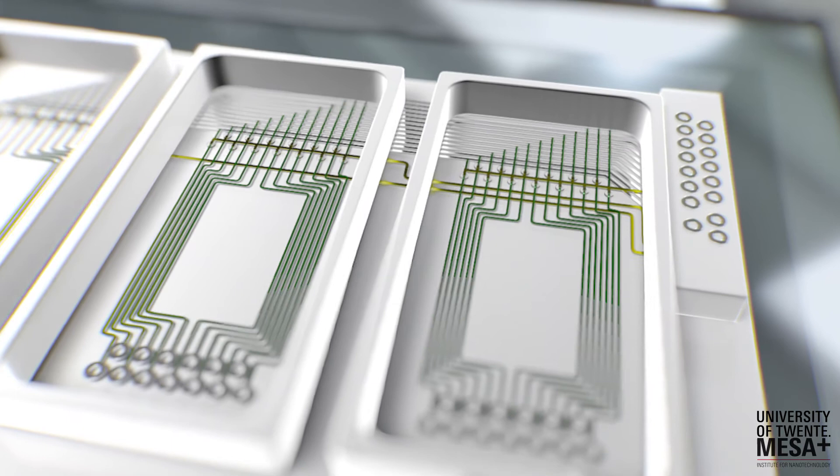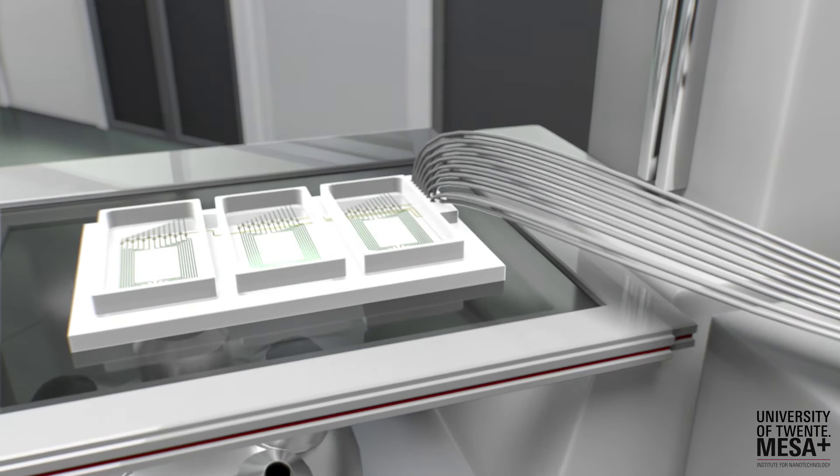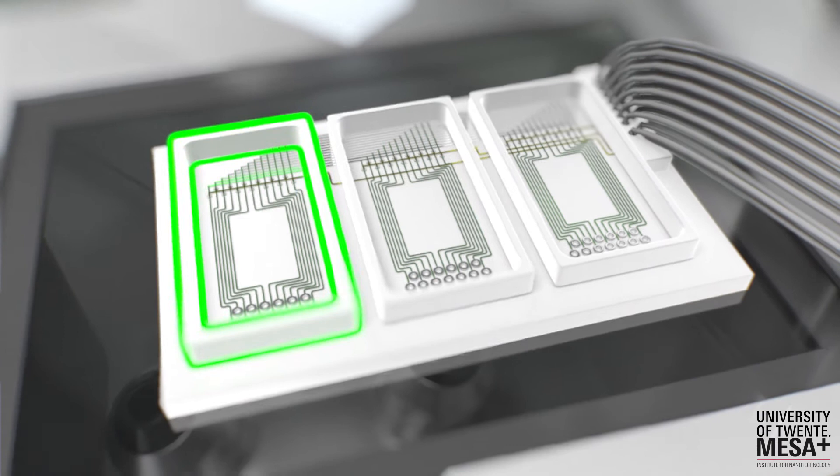So what does that mean for you? As a chip developer, you don't need to worry about how to drive the microfluidics, or read out the sensors of your device. You simply adhere to the few design rules we provide, and your new chip becomes plug-and-play for the biologist.